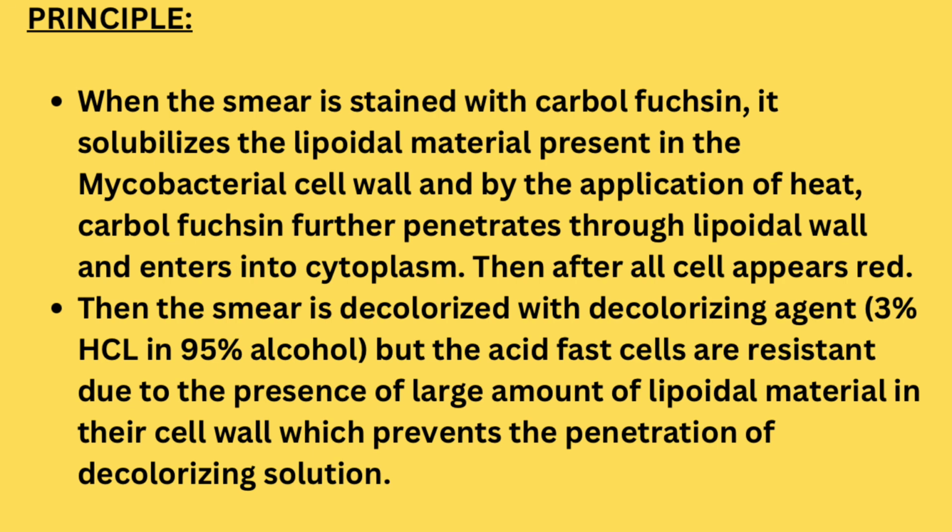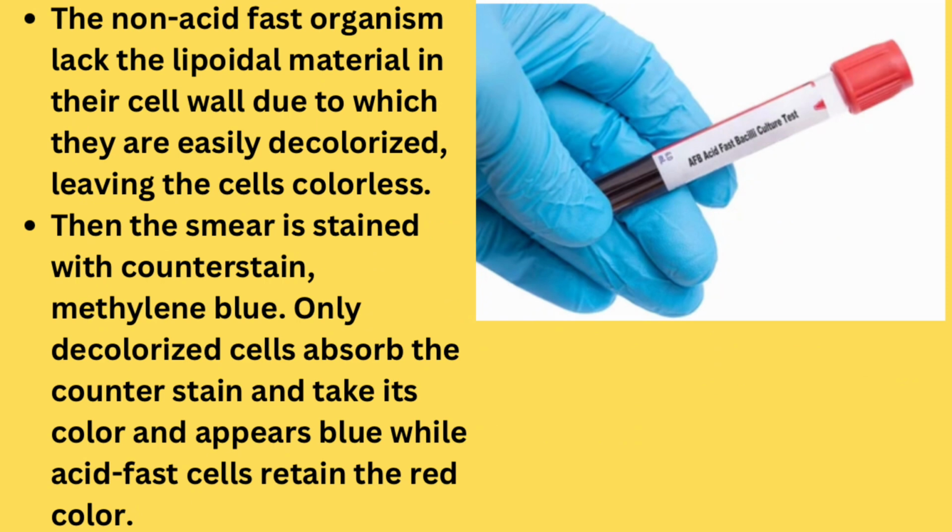But as we said before, acid-fast microorganisms are resistant to decolorization with acid alcohol. That is due to the presence of a large amount of lipoidal material in their cell wall, which prevents the penetration of the decolorizing solution. The non-acid-fast organisms lack the lipoidal material in their cell wall, due to which they are easily decolorized, leaving the cells colorless.